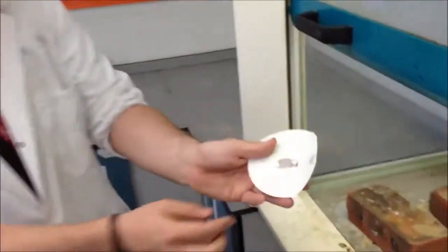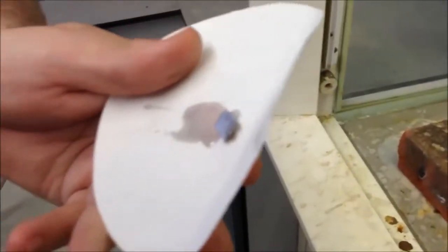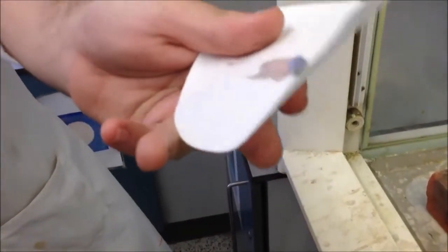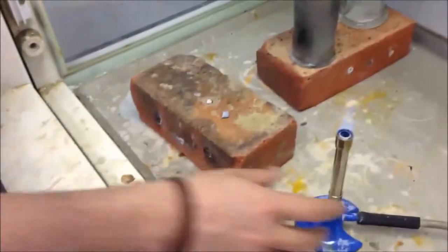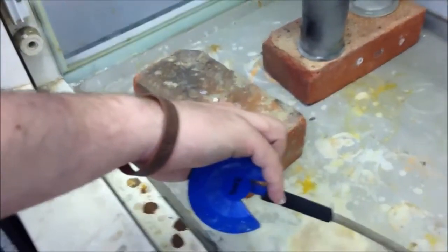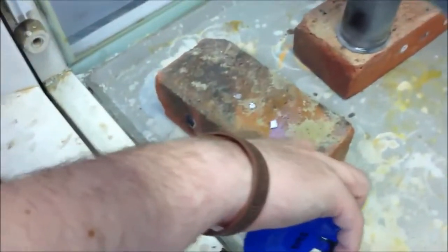Potassium is even more reactive, so this happens even quicker. If you look closely, there is a lilac tinge to the metal. That's the classic potassium colour. Okay, final one. When we burn it, it should be lilac as well.